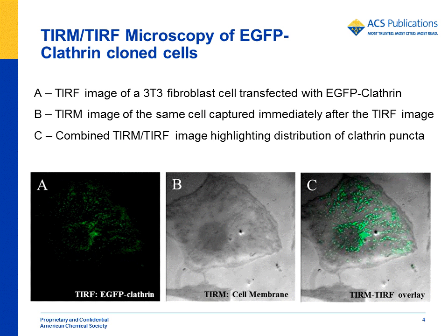Panel A in this slide shows a TIRF image of a 3T3 fibroblast cell, whereby discrete green puncta correspond to cellular membrane structures formed by the association of EGFP-Clathrin molecules and clathrin-coated vesicles, which are present within approximately 200 nanometers of the cover slip, i.e. within the imaging depth of this microscope.